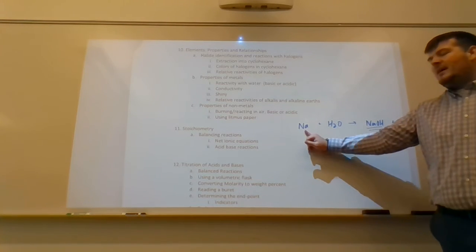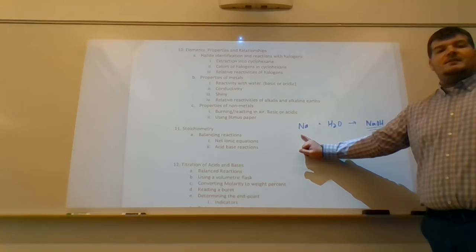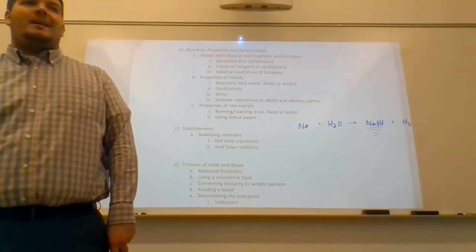That was an alkali metal. Let's think of another metal that we did this with. You guys did it with magnesium metal, didn't you? So you took some magnesium metal, you put it into some water, and then you tested it immediately. After you tested it immediately, what had happened?